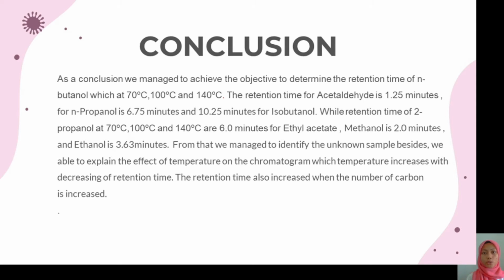From that, we managed to identify the unknown sample, besides we are able to explain the effect of temperature on the chromatogram, in which as temperature increased, the retention time decreased. The retention time also increased when the number of carbons increased.